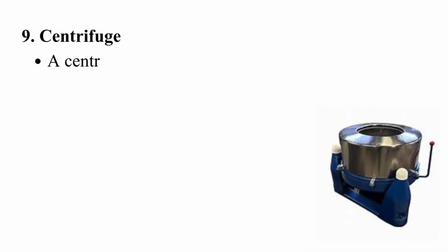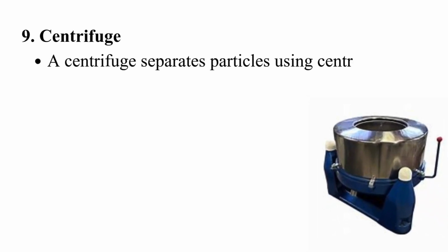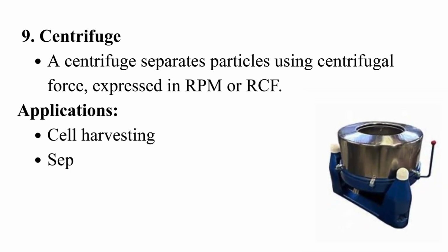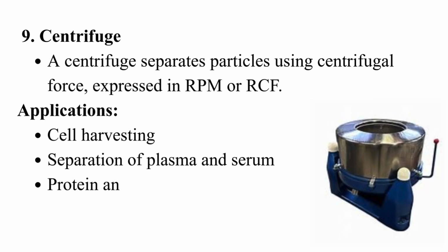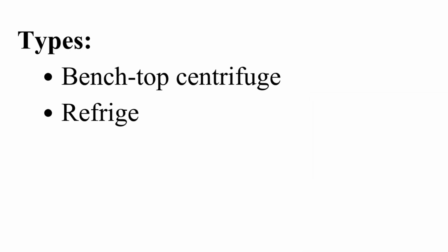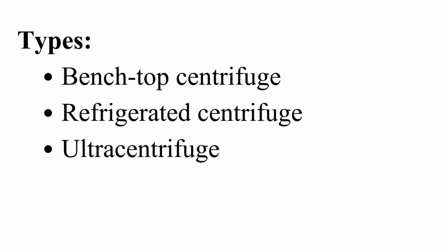Centrifuge. A centrifuge separates particles using centrifugal force, expressed in RPM or RCF. Applications: cell harvesting, separation of plasma and serum, protein and DNA extraction. Types: benchtop centrifuge, refrigerated centrifuge, ultracentrifuge.